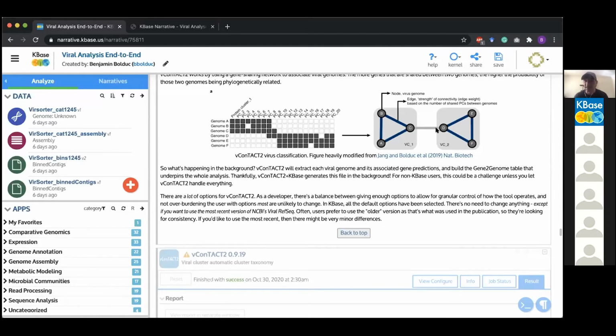Now, C and D share just a couple genes. So this is C, and this is D. Right here, they share 2 genes, versus the others that share 2, 4, 6, 8 genes. And only sharing 2 genes is going to get you connected, but it's not going to get you family or genus membership.